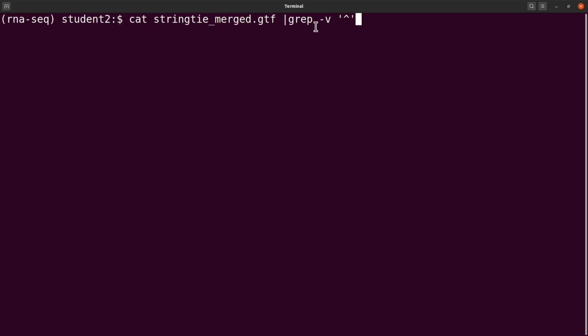That is what grep -v does, it's just an inverse. Those are the lines we want, but it's not all the contents, we want a specific column. So we use awk to get that column. These commands make life convenient if you are processing text files.